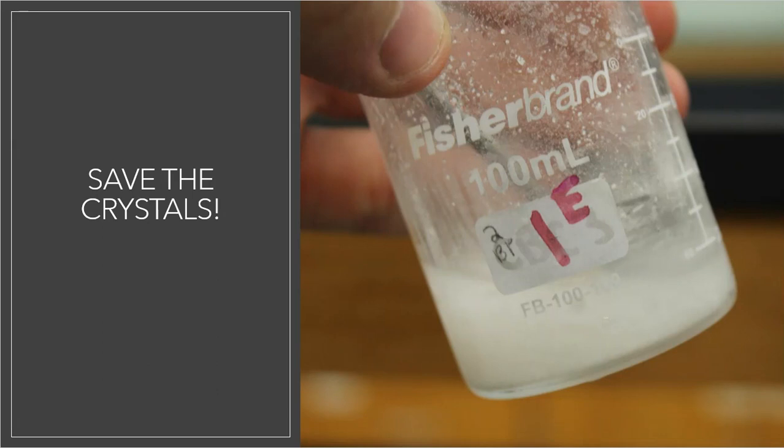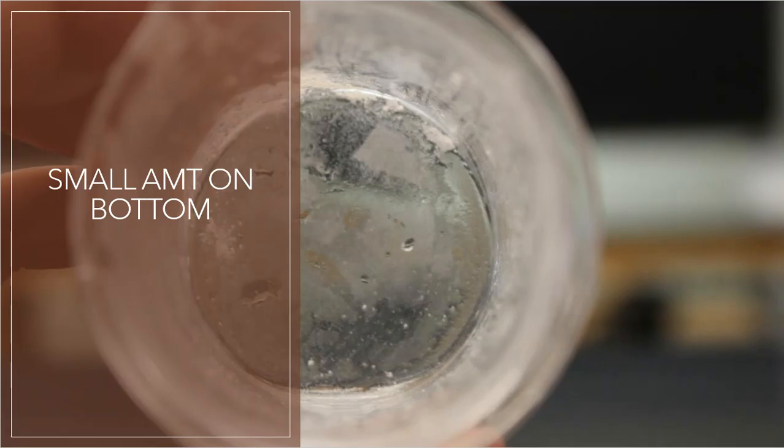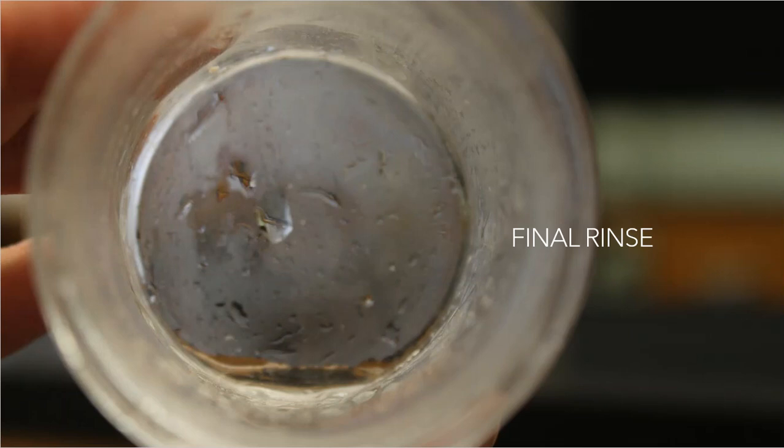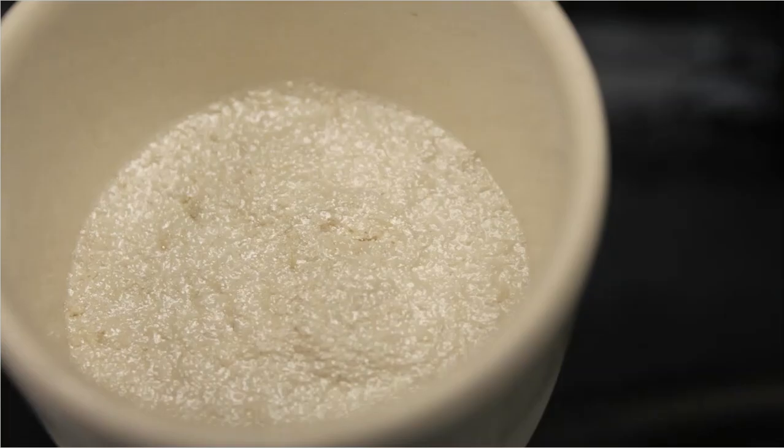This is what was left over in the beaker after that process happened. So I added some ice-cold solvent into that beaker, gave it a swirl, 15 milliliters is what I added. Looks like there were still some remnants there, and on the sides of the beaker as well, right? You can see those. I didn't want to lose any of that, so I added another 15 milliliters of ice-cold solvent. I gave it a swirl and a pour. And this was what was left over in the beaker. Hardly anything at all at this point. My recrystallized product, this is what it looks like.